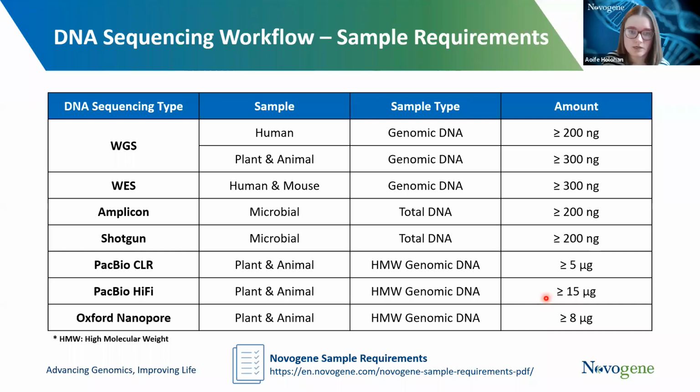Okay, thank you. Next is from Ewelina. Apologies if I'm not pronouncing that correctly. Firstly, saying very interesting presentation, so thank you. The question is, could you explain a little more about DNA epigenetic modification detection by PacBio?